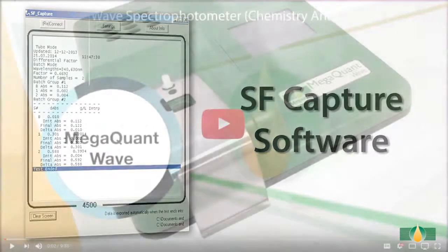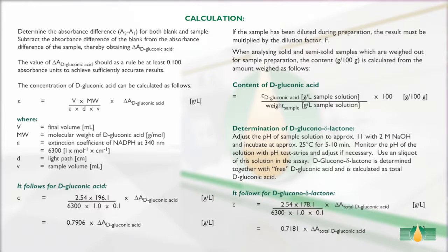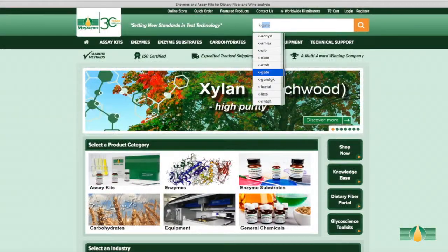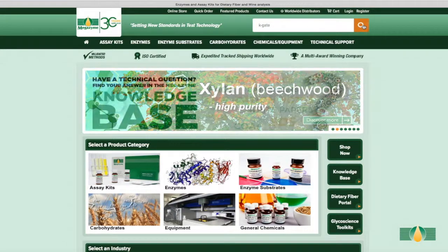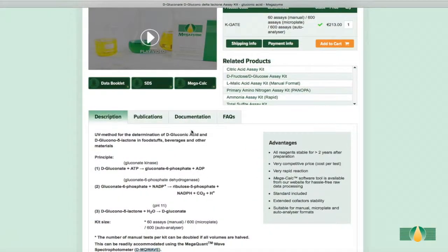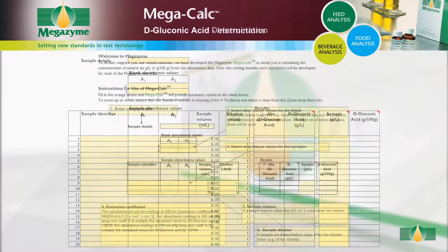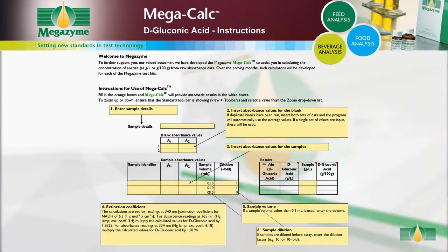Please see our MegaQuant Wave video for further details. If the results output are raw absorbance values for both blank and samples, the calculations of D-gluconic acid content can be performed manually as described in the calculation section of the kit booklet. Megazyme has also developed specific Excel-based MegaCalc applications for each Megazyme kit to allow quick and easy results analysis. Results can be analysed using the MegaCalc application specific to this D-gluconic acid kit, which is available to download free of charge from the Megazyme website. The MegaCalc spreadsheet provides full instructions for use.